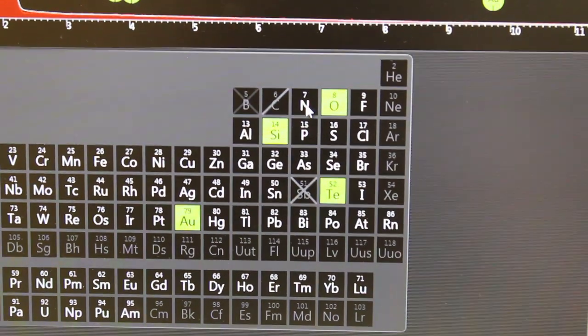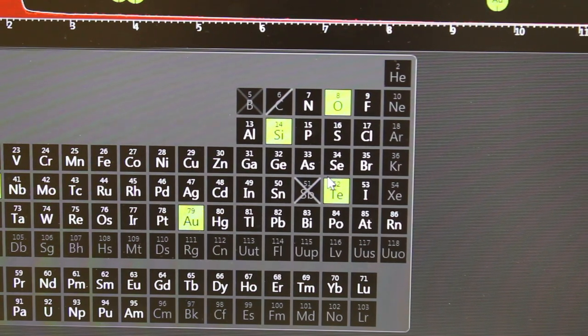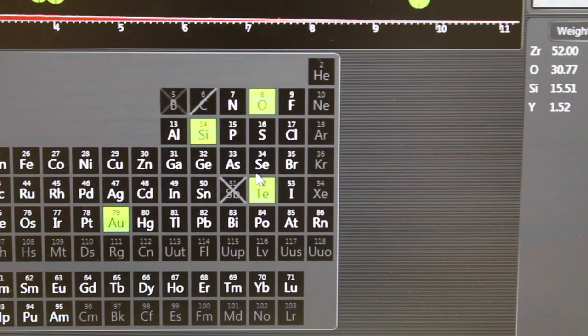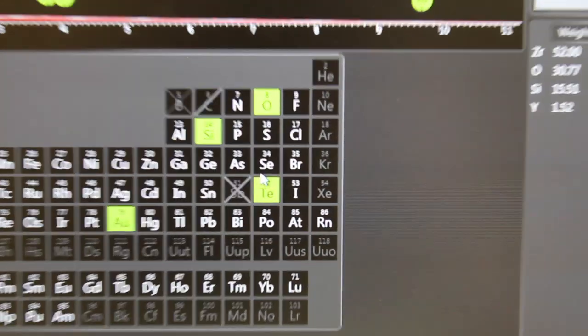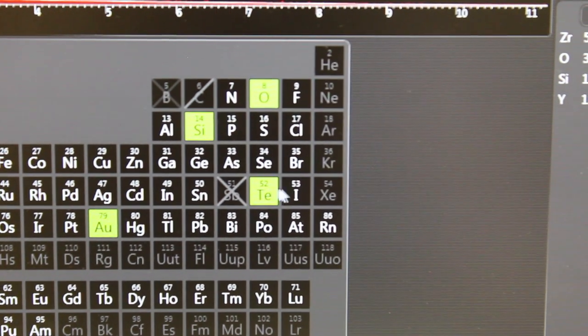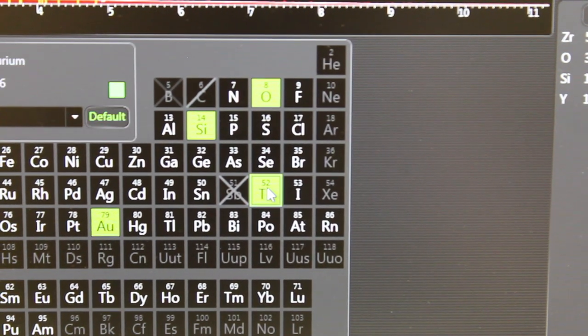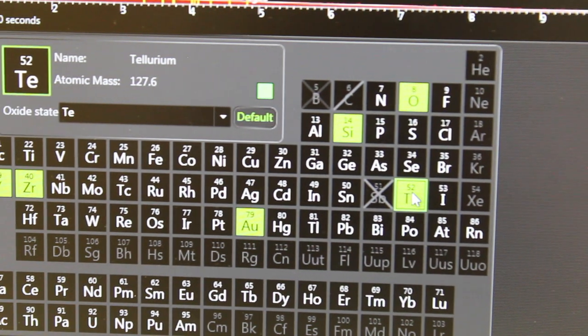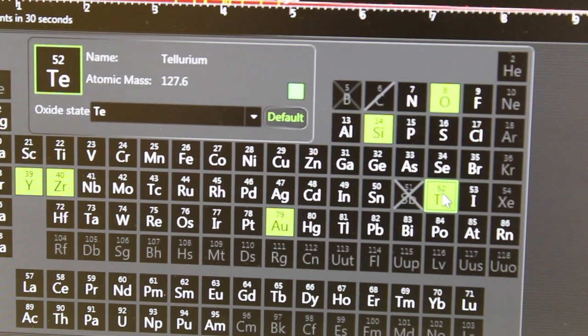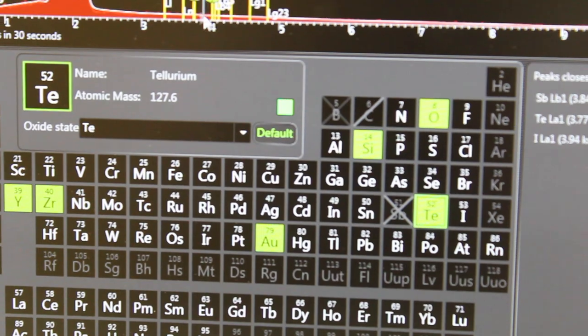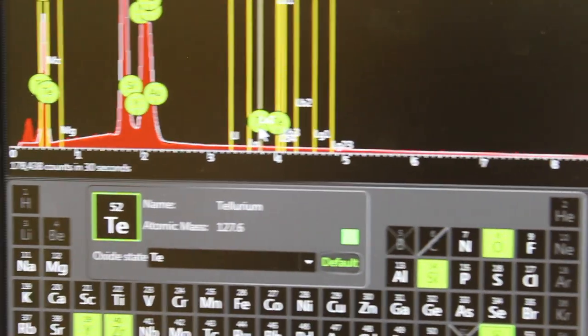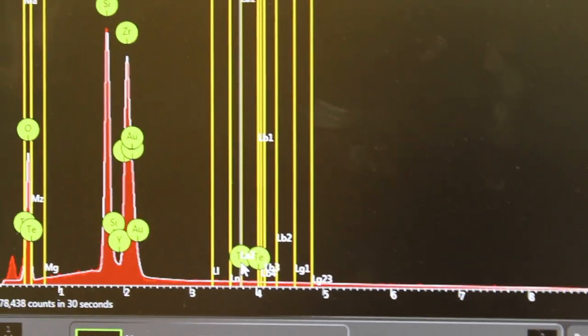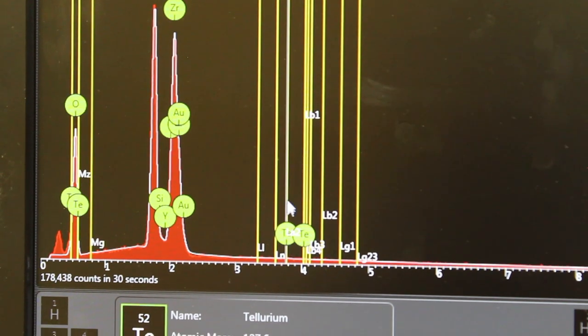Other things we might pay attention to are things that seem out of place for whatever rock we're looking at. This often happens here. This is tellurium. However, tellurium has overlapping peaks with other common elements and so you can see here these are the peaks for tellurium.